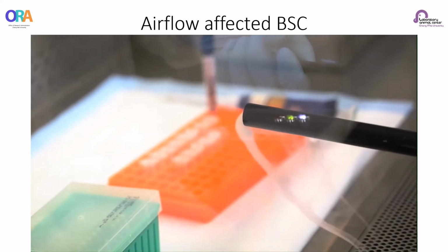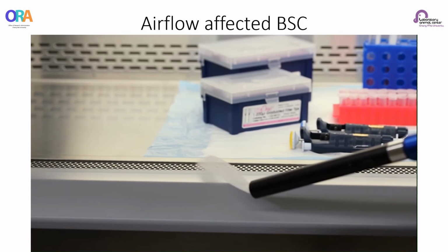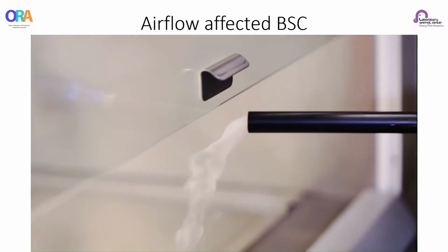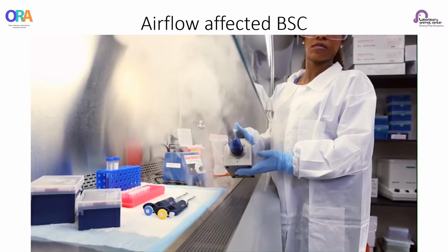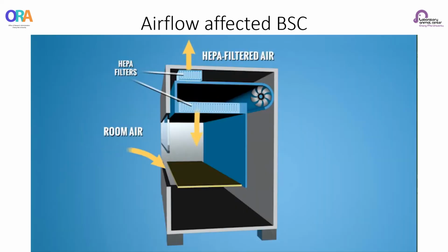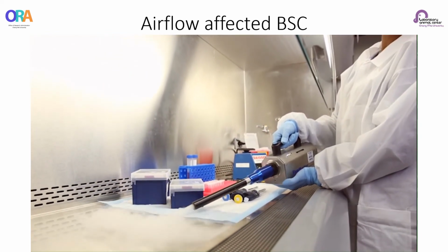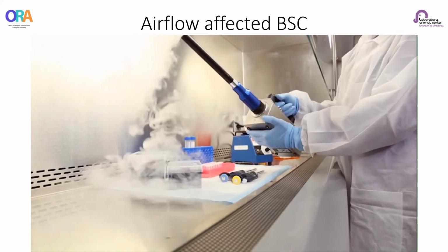For proper containment, air is drawn into the cabinet at the opening and then down into the front grille. Together, the sash and inward-flowing air provide an air curtain or barrier that is intended to keep cabinet air and room air separate from one another. To protect the work product, the cabinet's downward air is cleaned by a high-efficiency filter within the cabinet. Upon reaching the work surface, roughly half of the downflow air moves toward the front grill, and the other half moves towards the back grill.